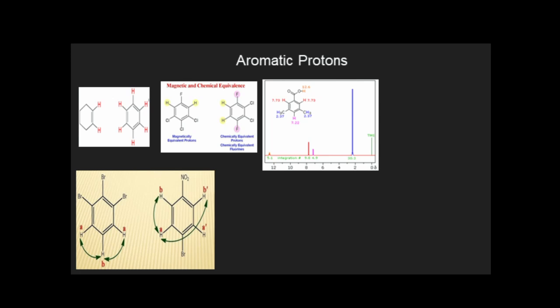Then let us consider aromatic compounds. For aromatic compounds, ortho and para directing groups and ortho and para substitution play a vital role. Here all the protons of benzene show a single peak. But for this compound, these 2 protons are chemically related with the fluorine as well as chlorine, so it shows a single peak. Here these 2 protons are ortho substituted to fluorine and para substituted to chlorine. So these 2 are in the same environment, that is equivalent protons, and show a single peak.